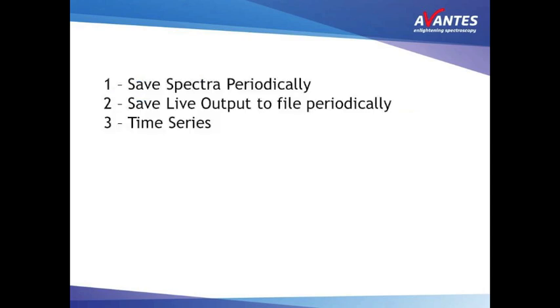If you want to follow a process in time, for instance follow a chemical reaction in time, with Avasoft there are multiple ways to proceed. You can use save spectra periodically, save live output periodically, or you can use time series.